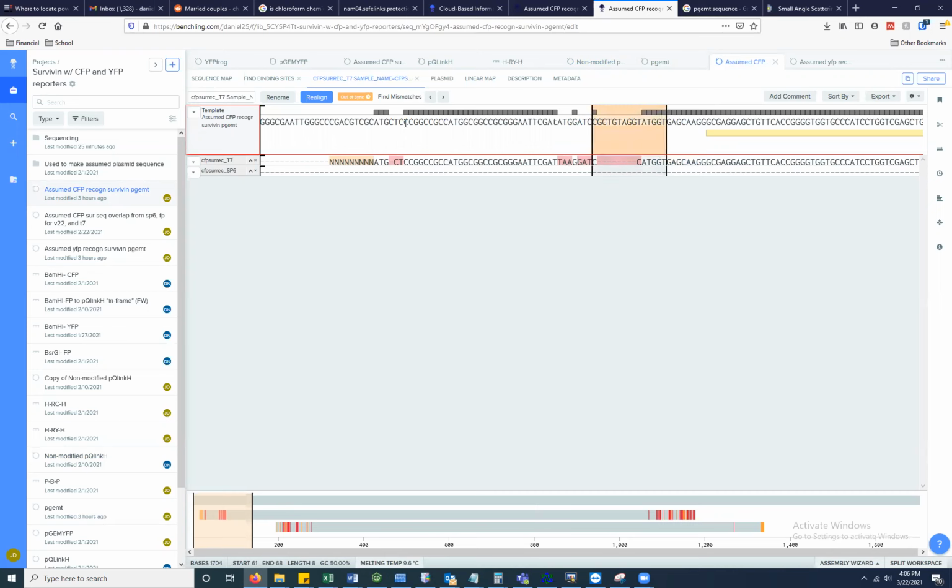And so what it does, it weights all these matching things versus how big the gap is. So if you have a lot of matching things and the gap's relatively small, it's going to include the gap. If there's not a lot of matching things, then it's going to make more small gaps in order to try and fit.